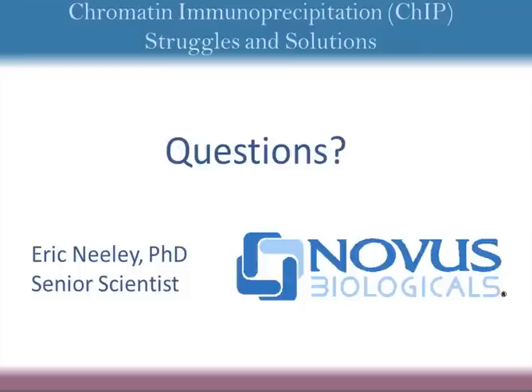It may be cutting too short, where you can't get the full amplicon size you're looking for. I usually recommend for RT-PCR right around 100 base pairs. Whereas with the sonication, you know that it's random, so you should be getting fragments right in that region of the amplicon that you're looking at, no matter what.